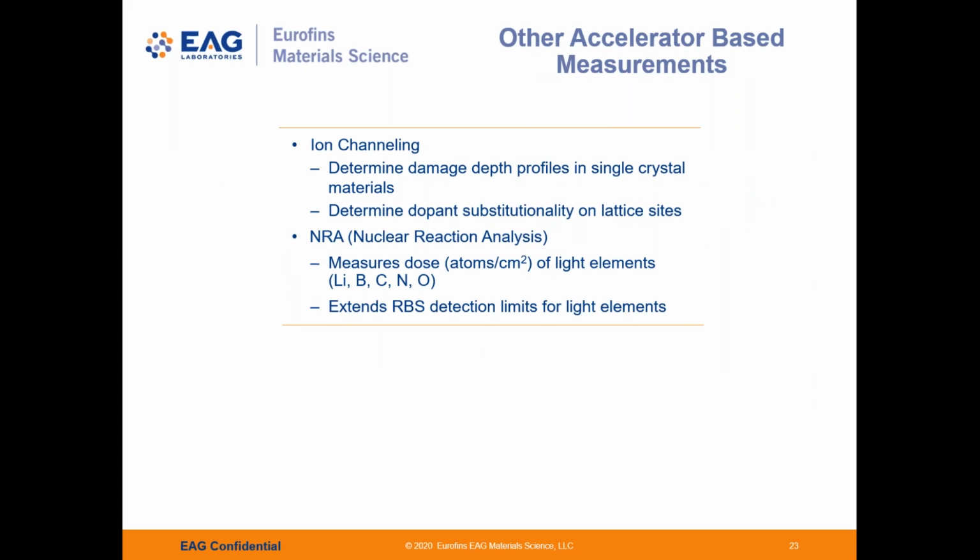As an ion beam technique, RBS can be used to perform channeling experiments. The incident beam is aligned parallel to a major crystallographic axis in the sample. Interactions of the incident ions with atoms on the crystal lattice steer ions into the main axis channels. The scattering yield is significantly reduced for ions on lattice sites, and amorphous and damaged regions of the crystal can be observed and measured.